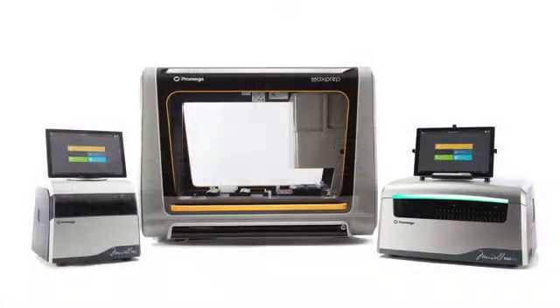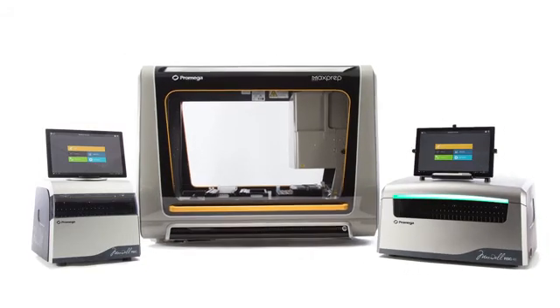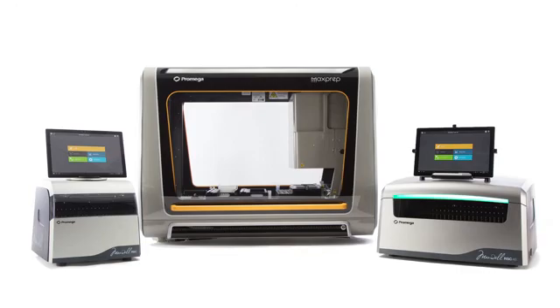The cohesive modularity of the MaxPrep Liquid Handler and the Maxwell RSC instruments will let you expand your system as your laboratory needs change. If you're starting with a Maxwell RSC today, you can add the Maxwell RSC 48 for higher capacity and the MaxPrep Liquid Handler for hands-free sample preparation as your throughput needs grow.